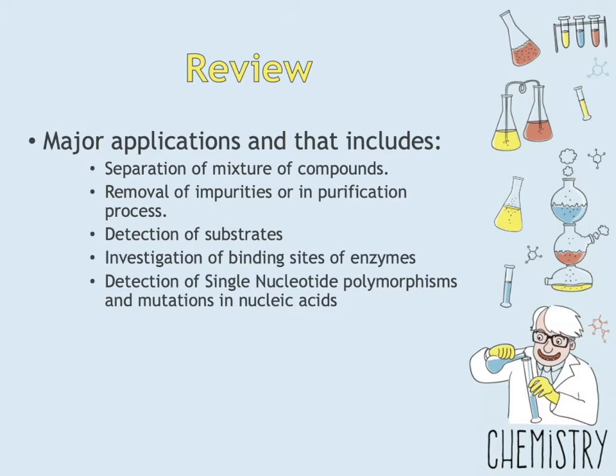Now that you have learned, understood, and recalled everything from the previous types of chromatography, I assume that you have inculcated in your minds the importance and applications of the first two types. So now, let's proceed to another type of chromatography, which is the ion exchange chromatography.